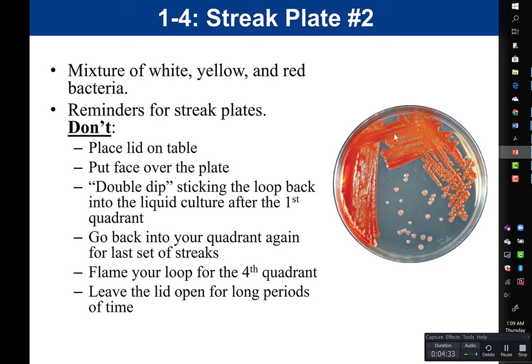Don't go back into your earlier quadrants when doing the last set of streaks. For quadrant four, make sure you don't accidentally hit quadrant one or two — only pull from quadrant three. Touching quadrant one would pull all that bacteria back out. And don't flame your loop between quadrant three and four — if you do, you won't have enough bacteria and won't get isolation.